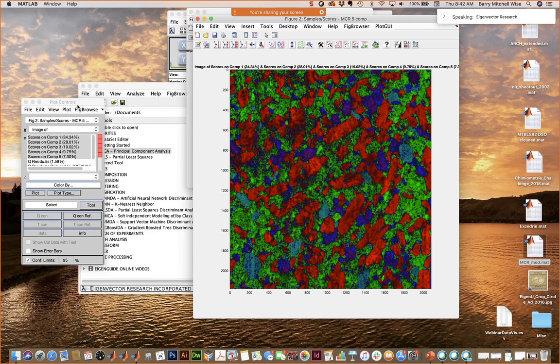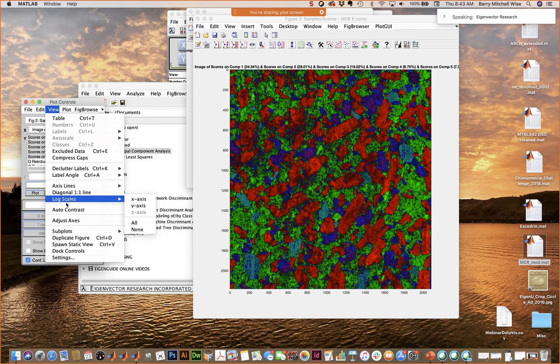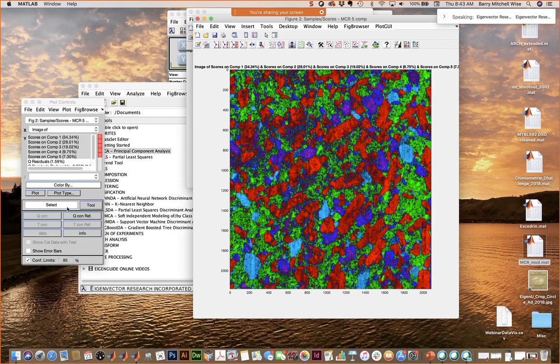Neil suggested maybe applying auto contrast. I think that's already there. Oh, okay. Bingo. Yeah, and that helps on this. But I don't know if you're looking for smoothing here or what. So yeah, maybe a post processing thing. I had one other request. I would love to see variance contribution plots.